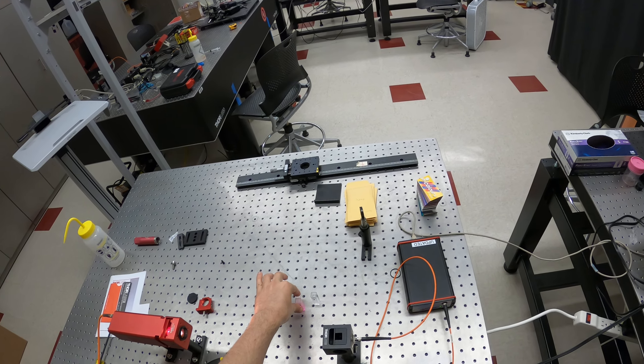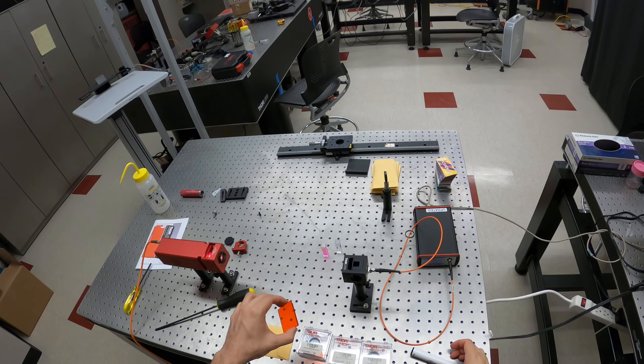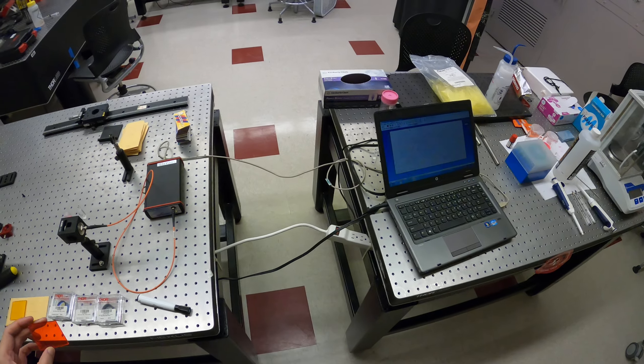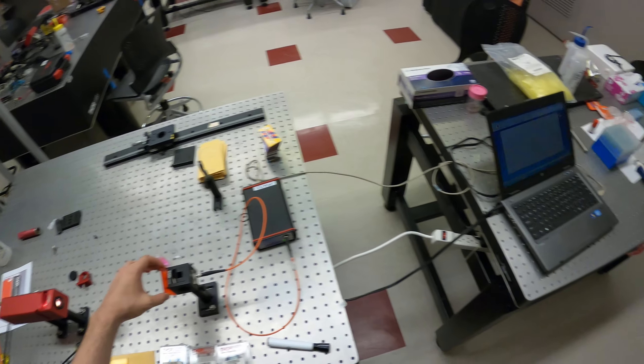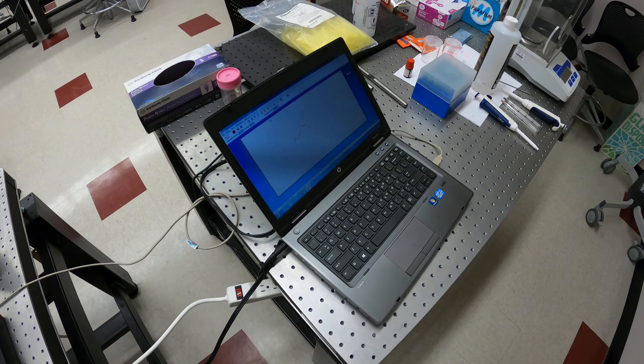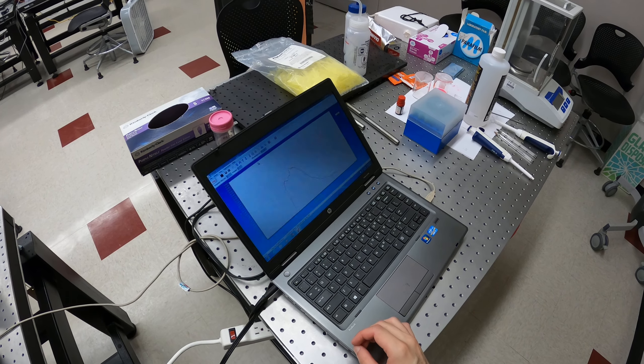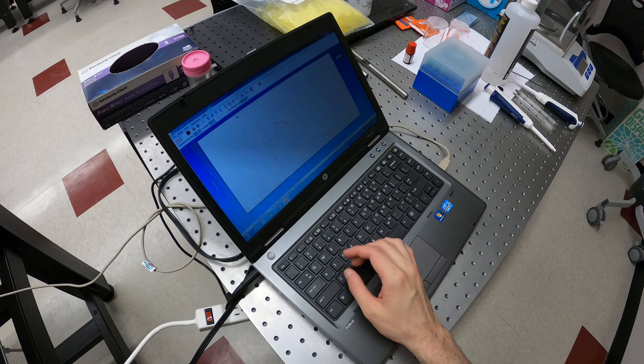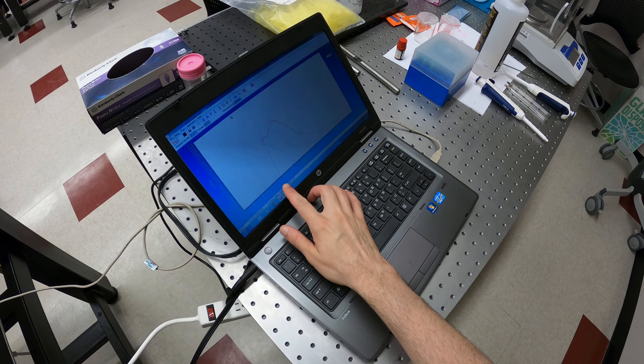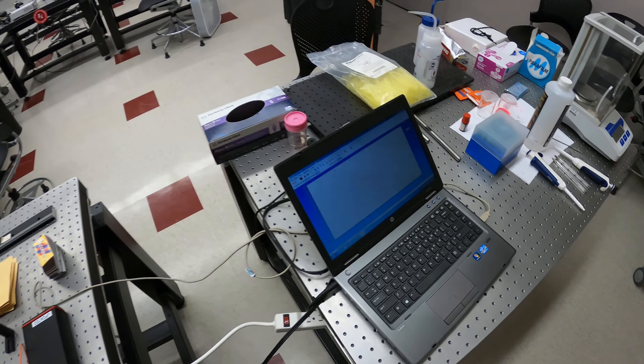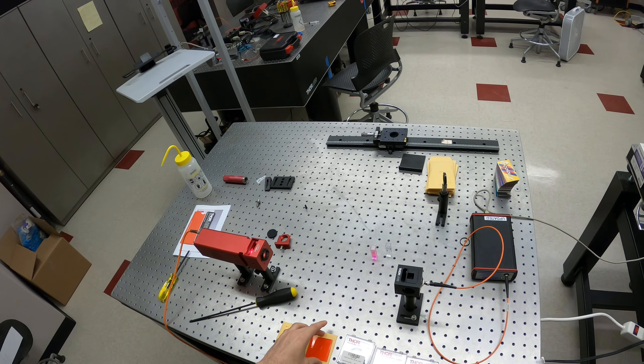Let me remove the rhodamine sample, and I can place, for example, this orange-reddish filter. And if I block there, when I look at the laptop, I can see transmittance only after 570 nanometers. This is the cutoff of this filter.